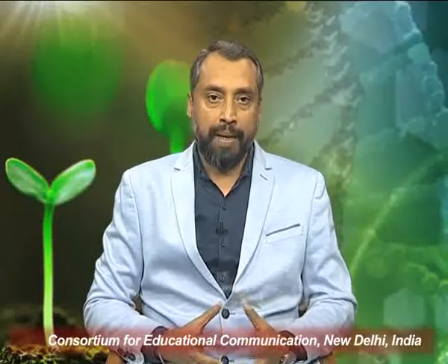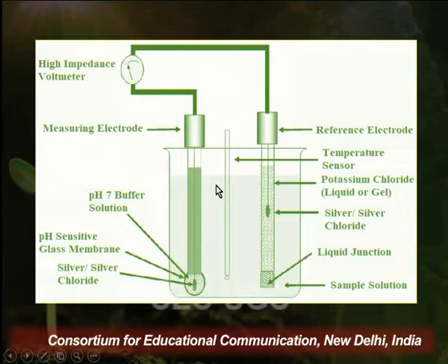Although in place of silver chloride electrode, sometimes a mercurous chloride electrode can also be used. So let us try to understand the working principle of a pH meter with the help of a diagram. A pH meter typically has two electrodes. The one electrode is called the reference electrode.